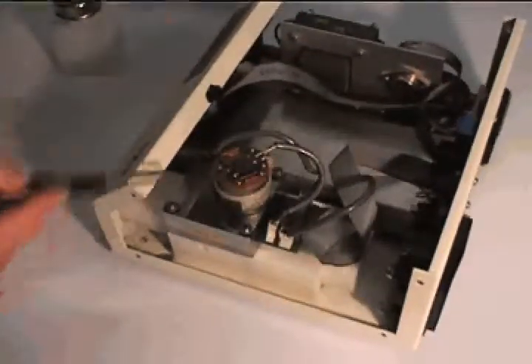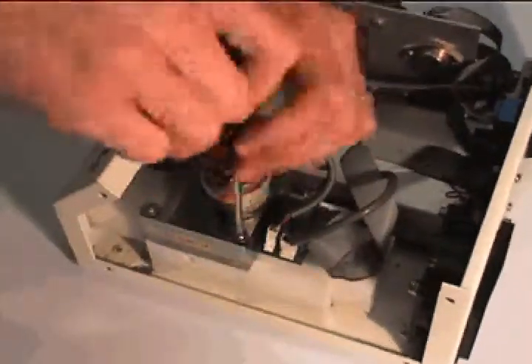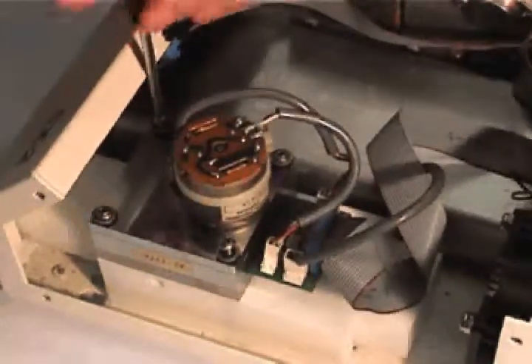Next, remove the 4 screws securing the sensor block. It is not necessary to disconnect any of the wire connectors at the back of the sensor block. If you do, make sure to note which wire goes to which connector, as 2 of the connectors are the same size.